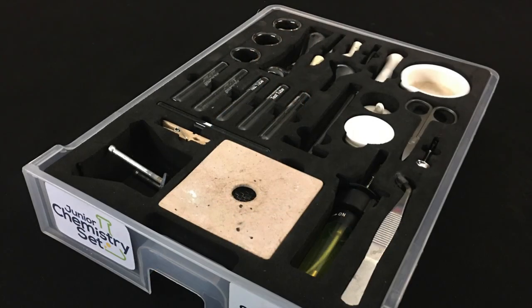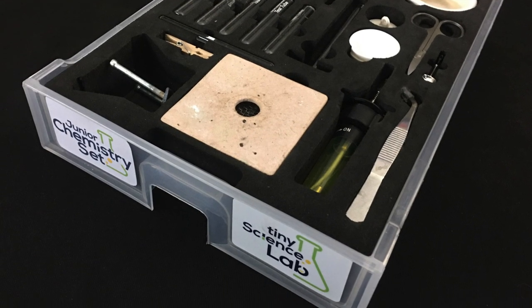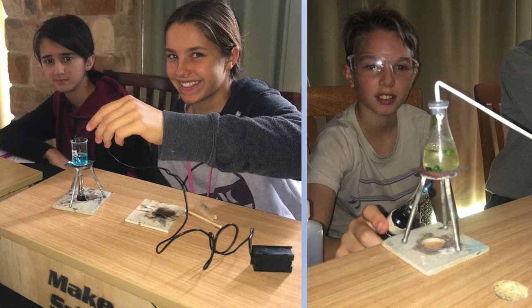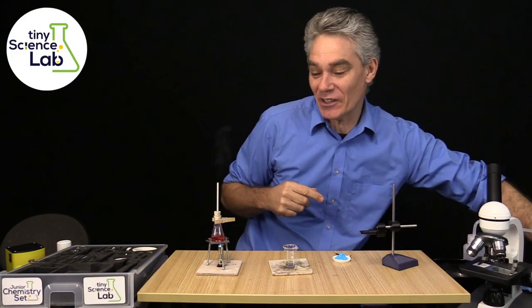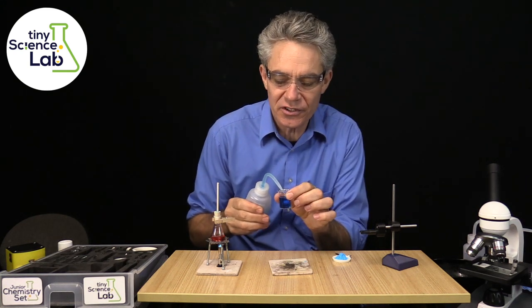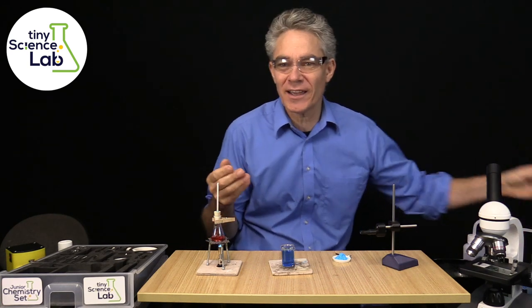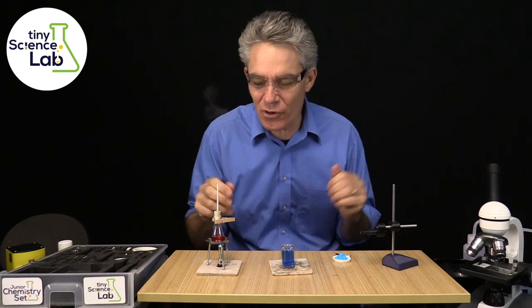So I started doing a whole bunch of research and I was able to pull together and manufacture a few things and put together these chemistry sets. Not only was I able to teach my daughter, but I also had 12 other homeschooled students come to my place and we did chemistry with them. Let me put on my safety goggles because I'm going to show you a quite dangerous demonstration that even teachers at schools are reluctant to do, but this is something I get 12 and 13 year olds to do in one little room.